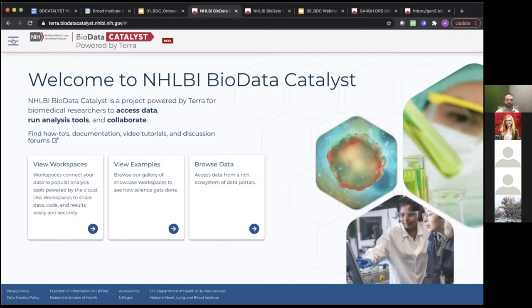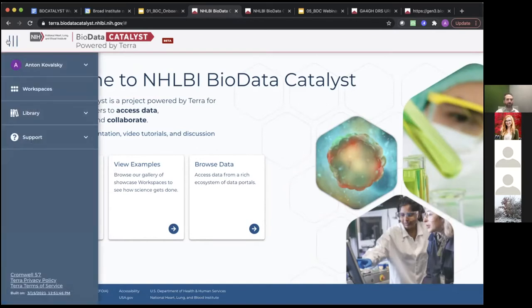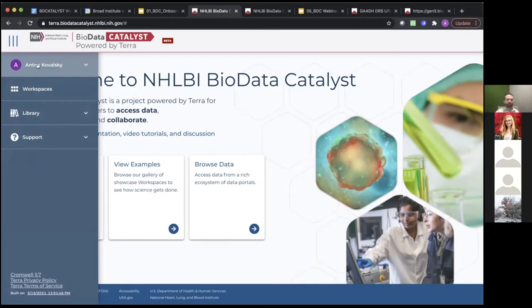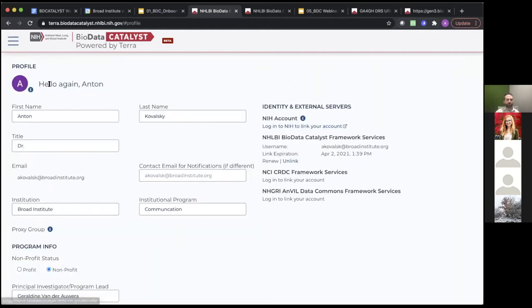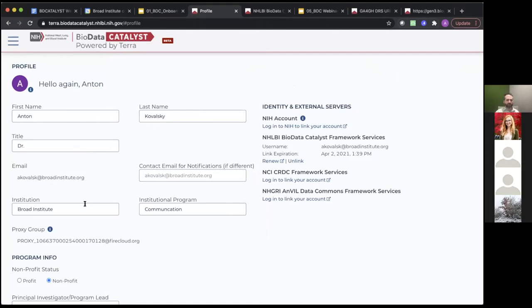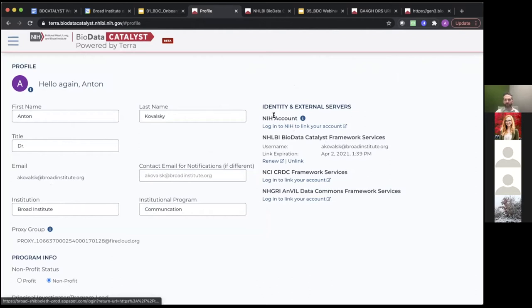So this is our landing page. If you click on the main menu icon at the top left, you will see the main menu pop up on the left. The first thing we'll look at is what you can find under your own name. Here you can go to your profile, which contains some important information about your proxy group.